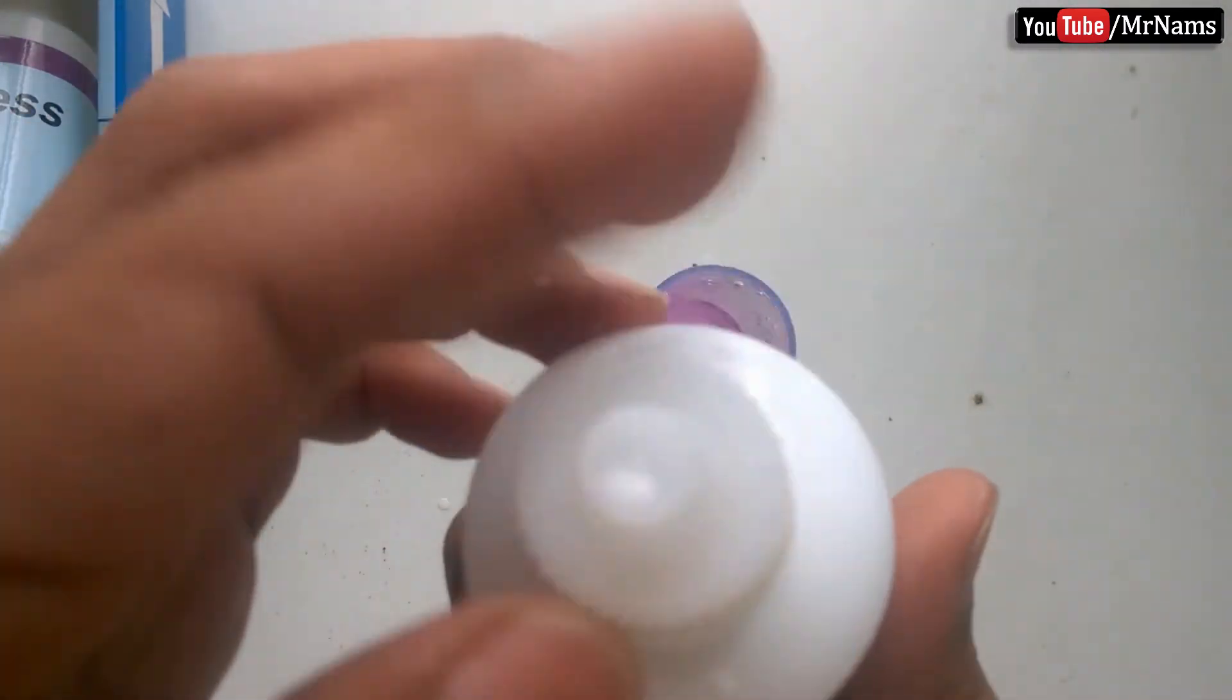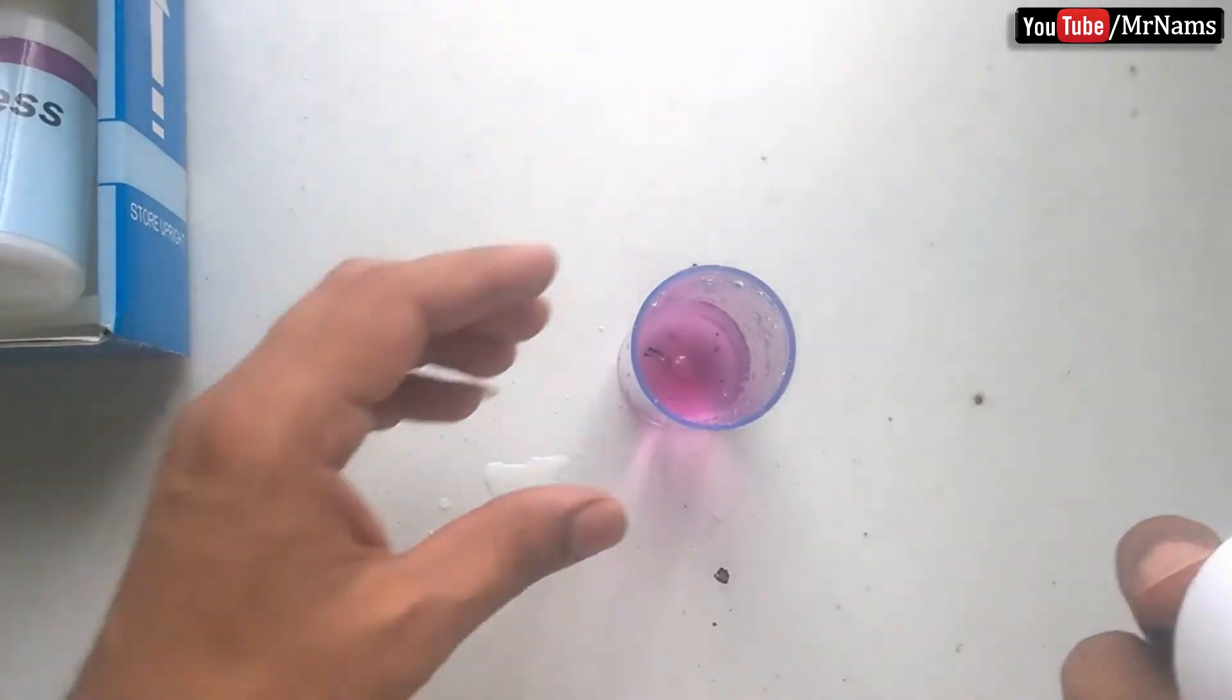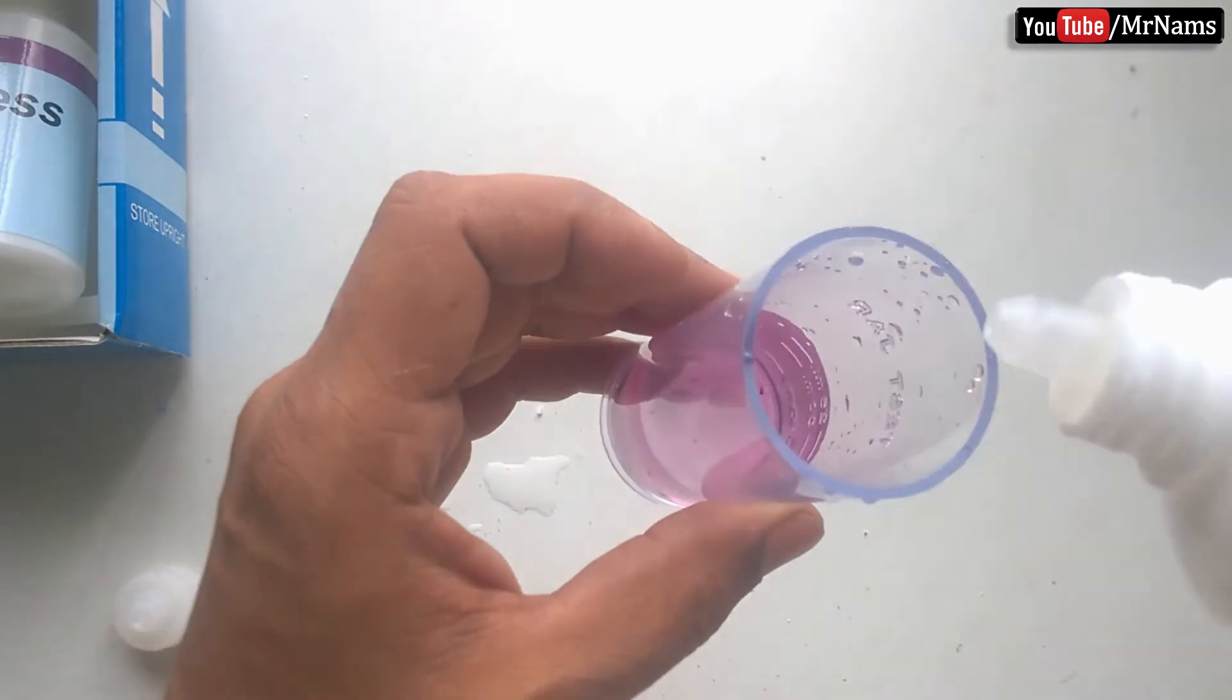Now add reagent D5 with gentle shake after each drop, until color changes from pink to blue.